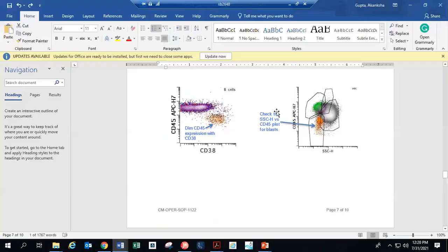Do you usually do TdT marker in B-ALL? I think TdT would also help. It does help when you do it. But in our lab at MSK, we didn't routinely do TdT because the other markers were enough to call it a B-ALL. It is a special intracytoplasmic stain. In my previous practices, both were doing it, so that's how I used to do it.